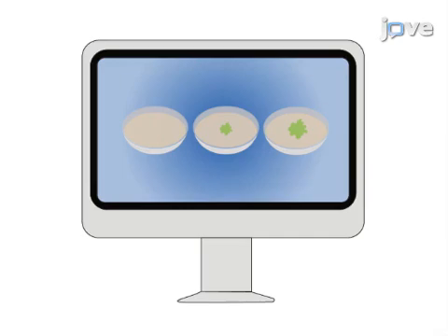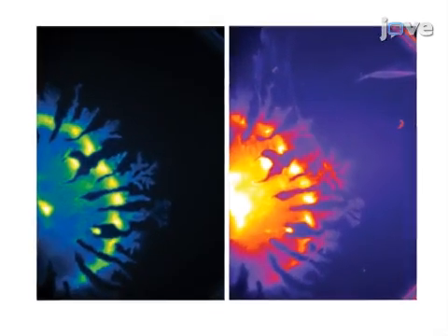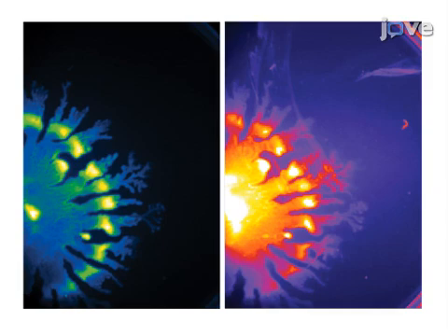Ultimately, this procedure provides a standardized protocol for surface motility plate assay preparation to generate quantitative dynamic information such as swarm expansion rate or bioproduct density distribution for surface motile bacteria.